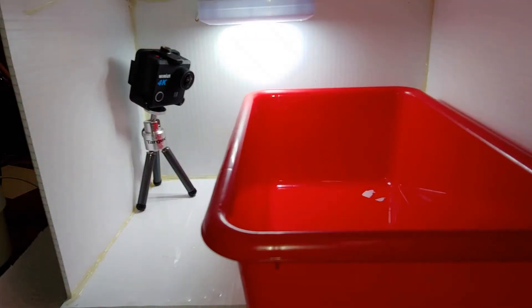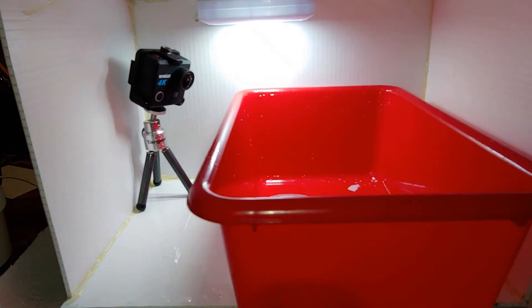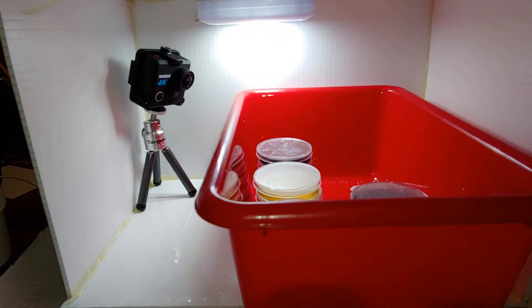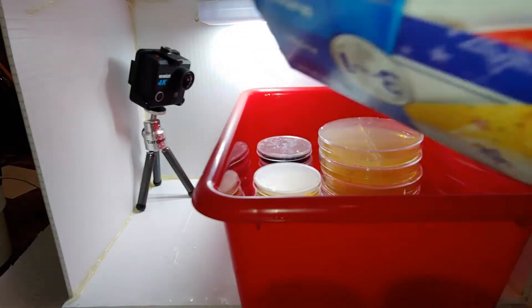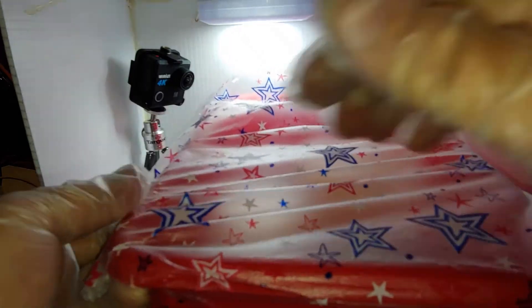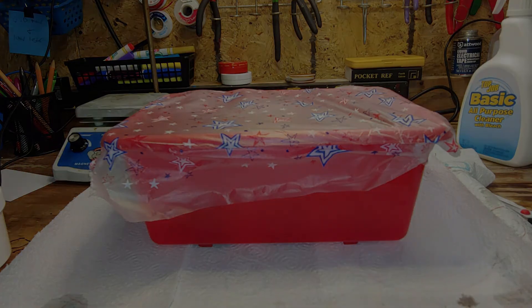Grab some kind of container that your petri dishes will fit into and clean it out with bleach. Then carefully place them inside. I also put some leftover dishes I made up about four months ago in here — they really will last a while if they're properly prepared and stored. Cover the top of the container with a lid, plastic wrap, parafilm, whatever — Press and Seal is my personal favorite. Transfer to a level surface and allow to cool down naturally. Do not put these in the fridge.